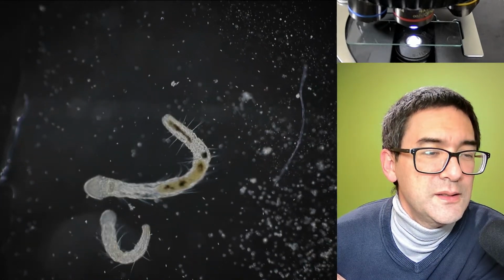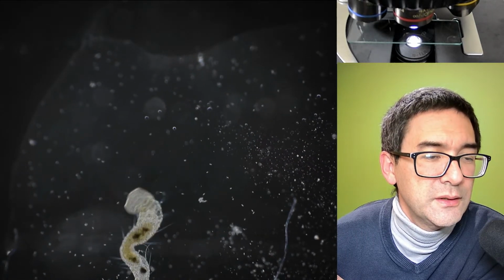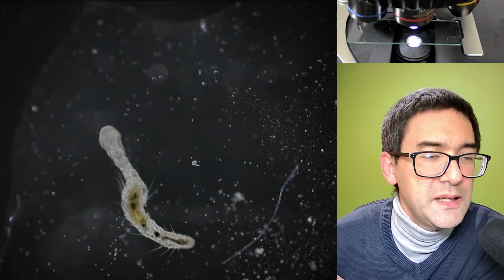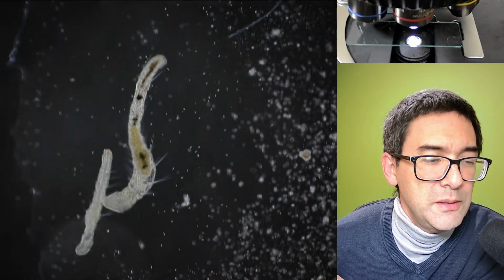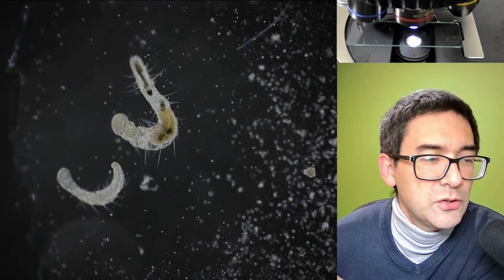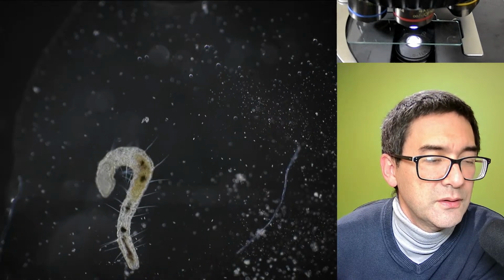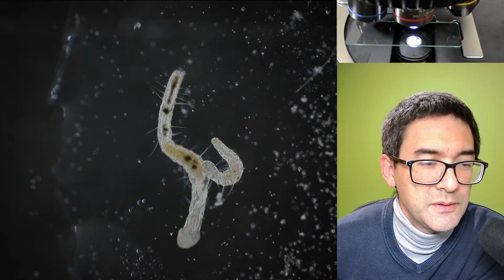Yeah, but look, this here is a little bit interesting in the sense that on the left side, that's the end of the droplet, right? And it cannot move towards the left because this is where the droplet ends. But as soon as it goes to the right, when it touches the place where the concentration is so high, it turns around. So maybe it is indeed able to sense that. See, it turns around again. On the left side, it turns around because it cannot go further anymore. And on the right side, when it touches that, it seems to turn around because it somehow doesn't like whatever is there. So maybe these worms are indeed able to sense it. See, it turns around again.